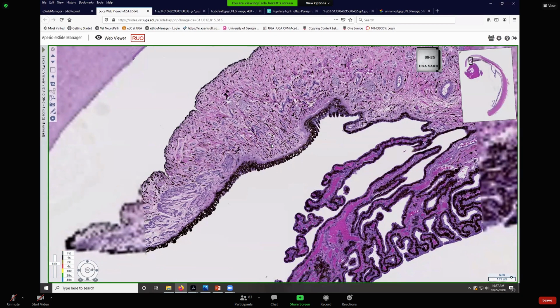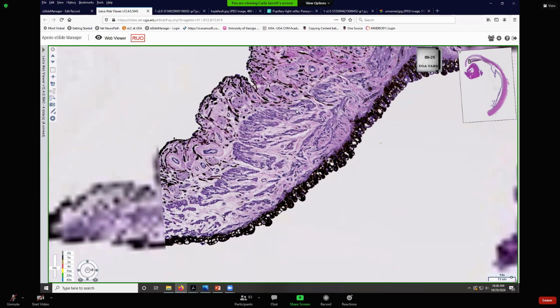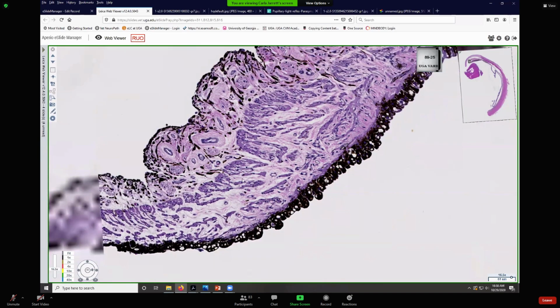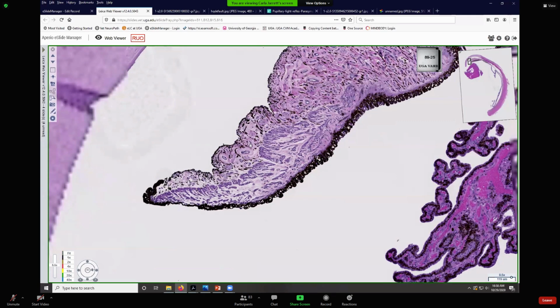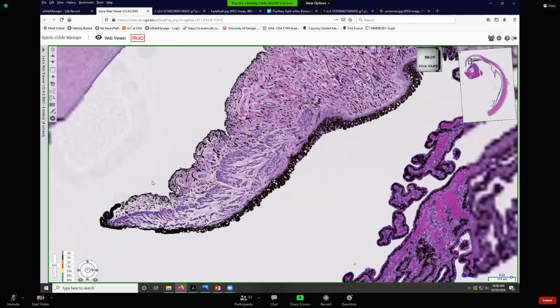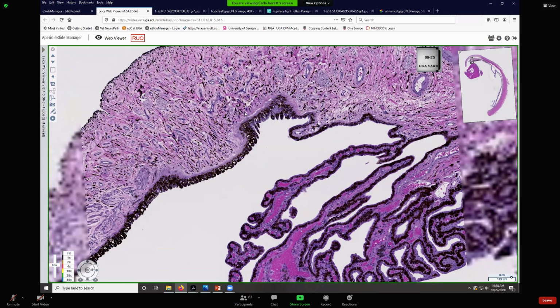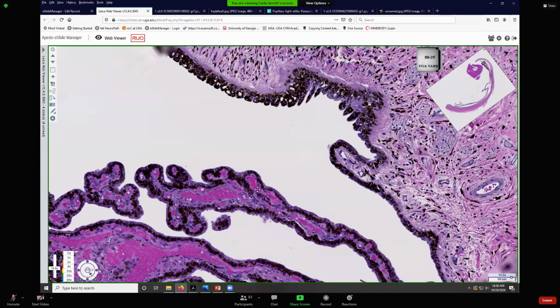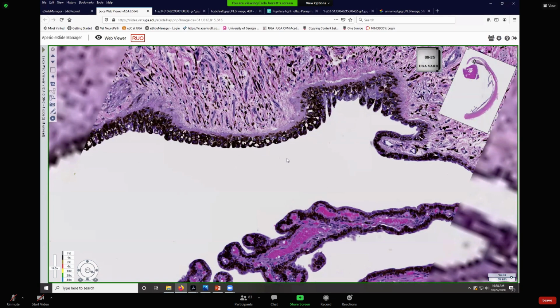So what do those look like on histological section? Well, these sphincter muscles you will expect to be in cross-sectional profile, and here they are. Smooth muscle has centrally placed nuclei, and they're going to be just near the apex, the tip of the pupil. So right here, this is your sphincter muscle. This is what draws the curtain closed. Your dilator muscle is kind of funky. It's arranged longitudinally here, but it's part of a myoepithelium. What do we mean by that? It's an epithelium that became modified and took on contractile properties. So it's not entirely a muscle and it's not entirely an epithelium.